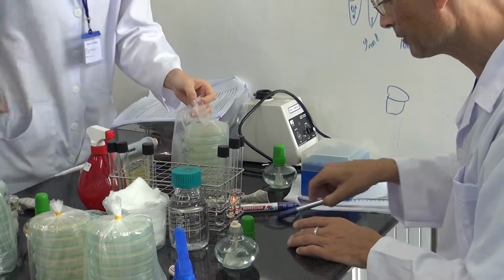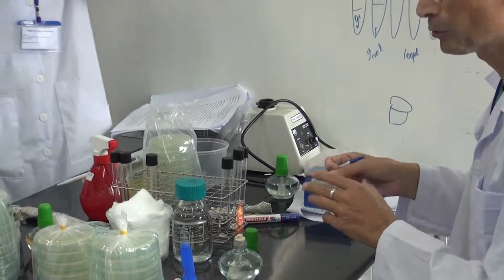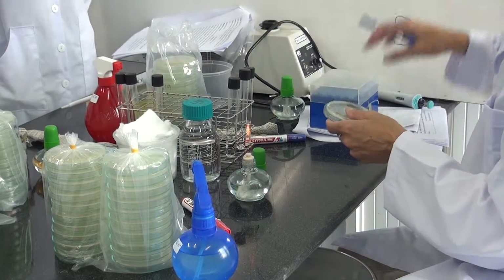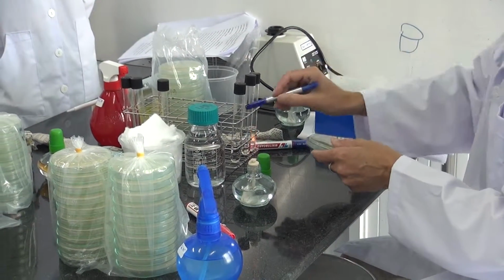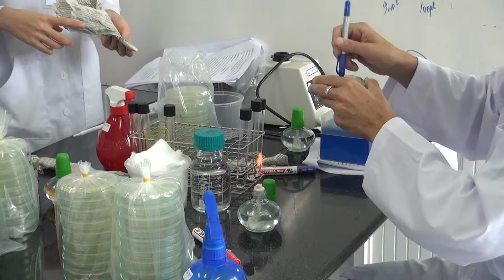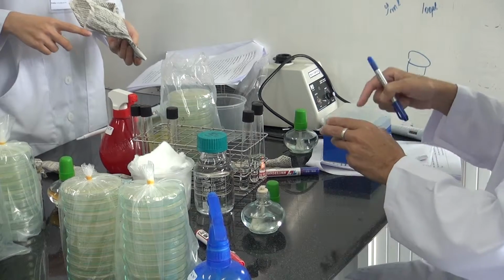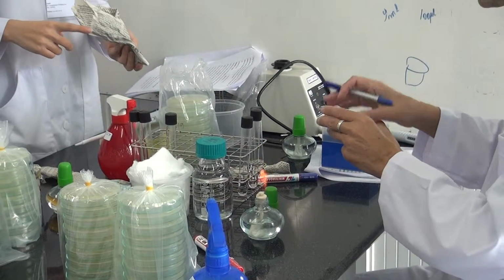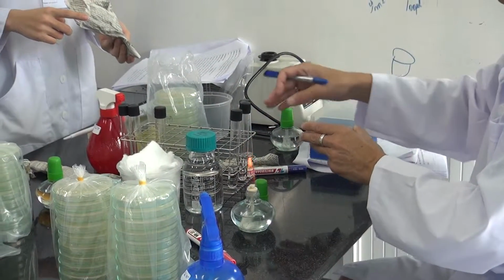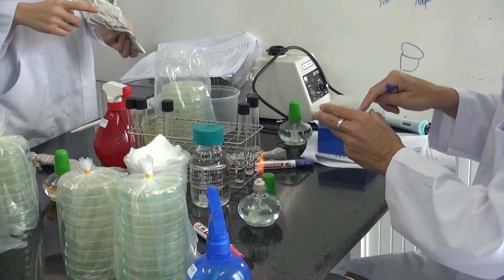Okay, it is very, very important always to mark down what you're doing. So you prepare, not like I'm doing now. Before you start working, everything has to be written. So the dilutions, if you want to write the dilution on the plates: if this is -2, -2. If this is -3, -3. The number of the replicate, so you know that it's a replicate from this dilution or that dilution. And of course the sample, if it's, let's say, bulk soil or rhizosphere soil, has to be written.